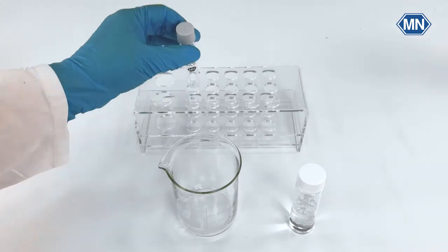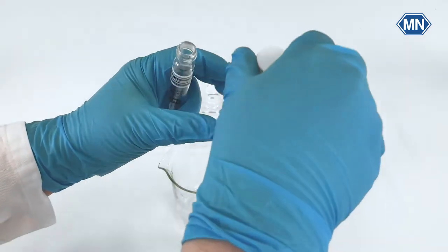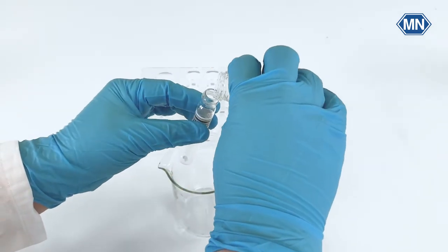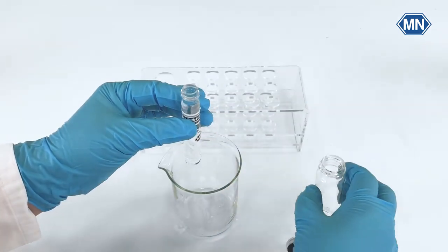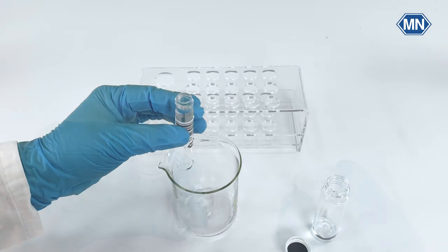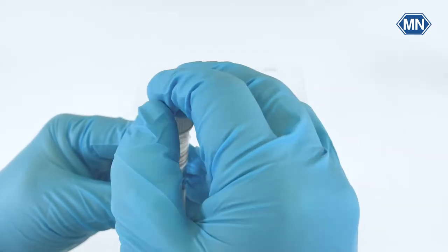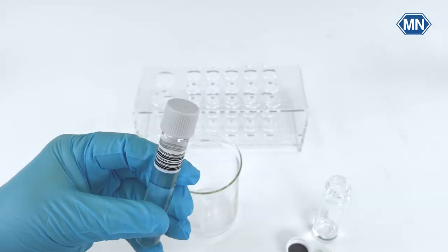Take a test tube, open it and fill it to the brim with the diluted water sample without letting air bubbles in. Close the test tube without letting air bubbles in. After this mark it as the sample tube.